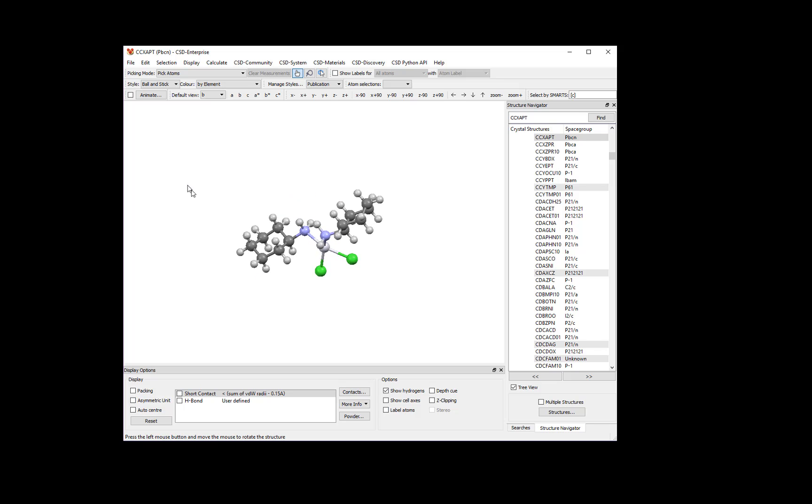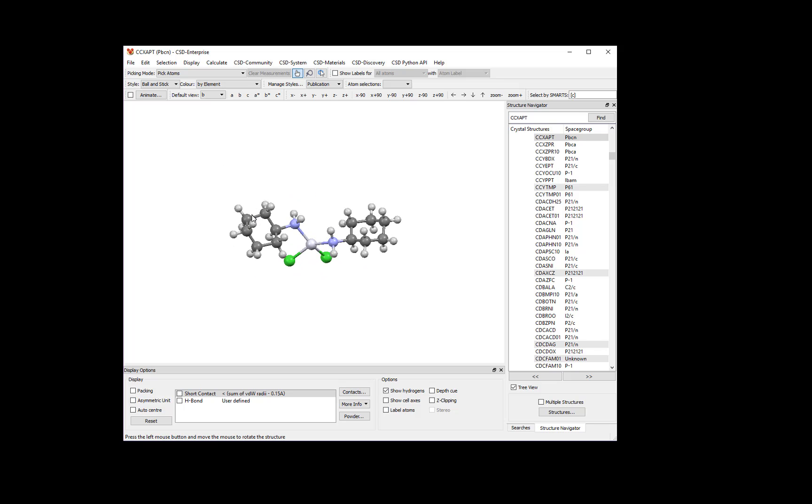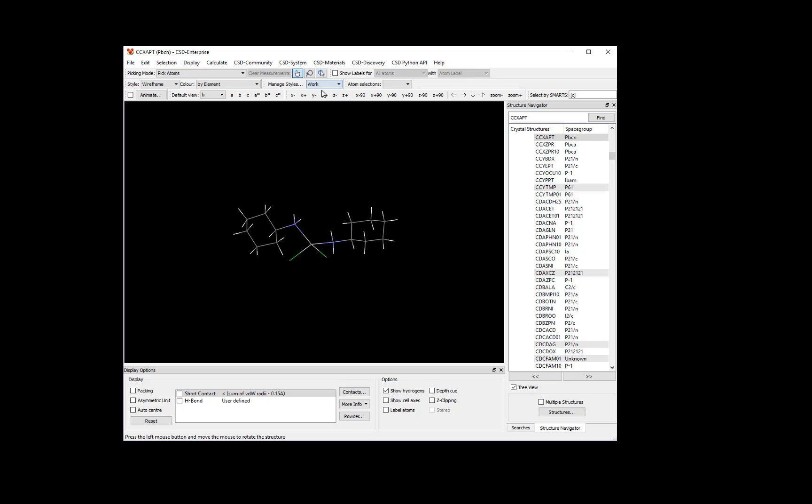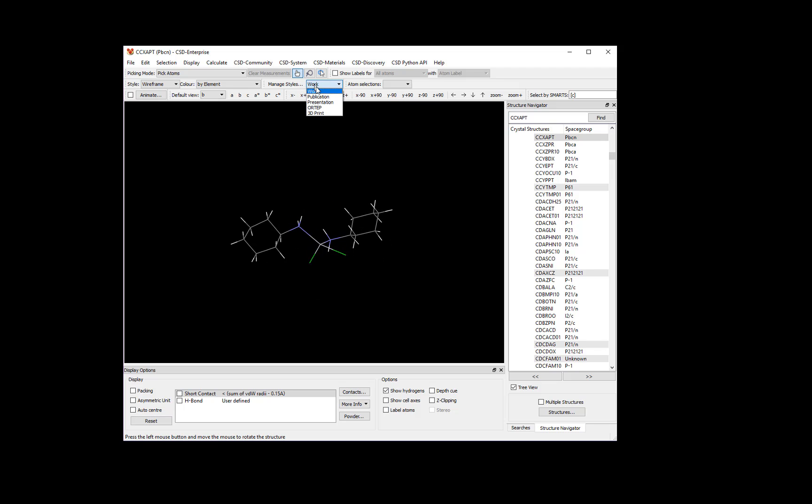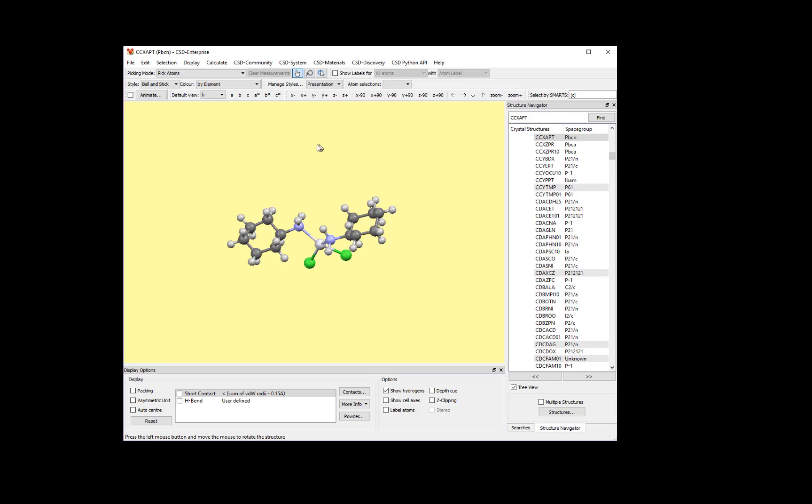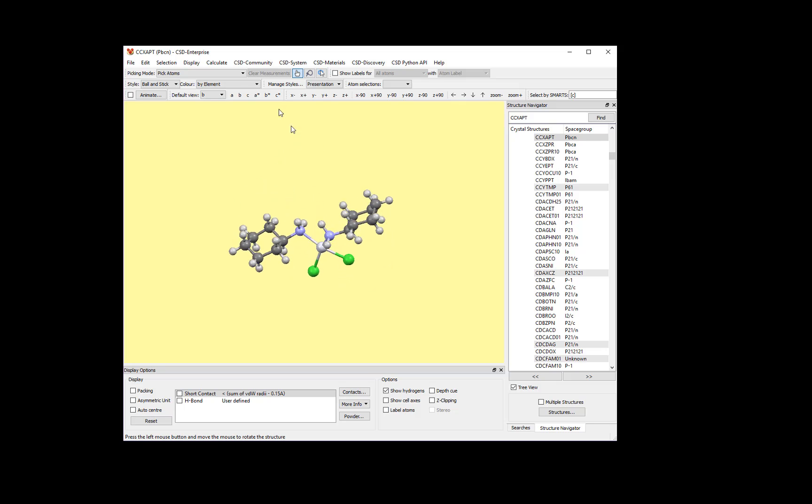To generate the view I show here, find the Manage Styles drop-down box and choose Publication. We can experiment by choosing other styles from this menu to see how the view changes. For example, Work gives a wireframe with a black background, and Presentation gives a ball-and-stick view with a yellow background.